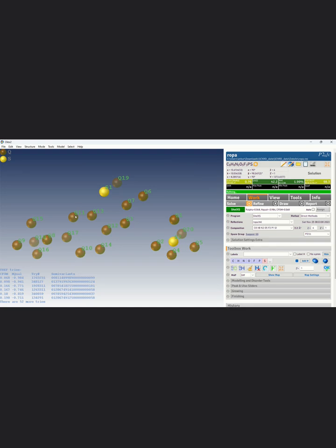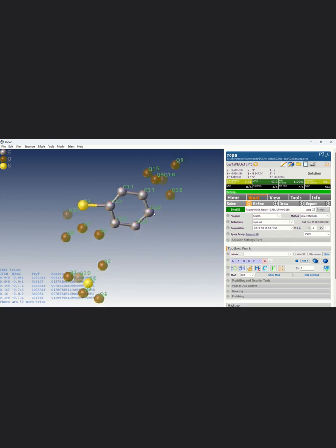We can make these carbon atoms, as we can predict that there are 8 carbons, 8 hydrogen, 2 nitrogen, 5 oxygen, 3 fluorine, phosphorus and sulfur. So I can make the structure by prediction. So I will make these 6 atoms, 6 electron density peaks, as carbon. Click on the carbon. So it is made as carbon.